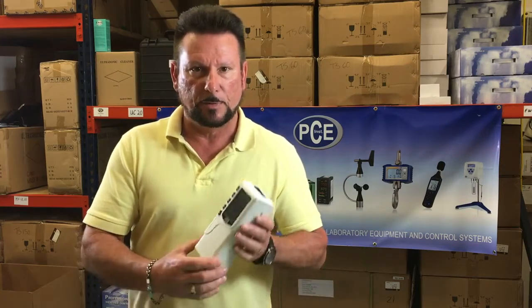Hello, I'm Donald from PCE Instruments and today I'm going to be demonstrating the color meter CSM2.